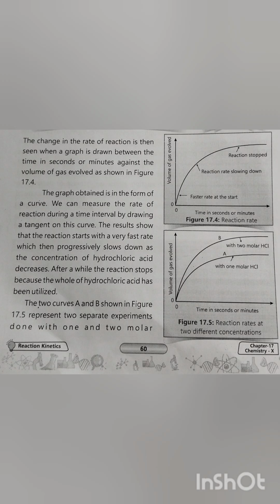The next step is methodology and data collection. First is gas evolution. As soon as the reaction starts, carbon dioxide gas is generated. How do we measure it? The escaping gas travels through the delivery tube and is collected in the gas syringe.